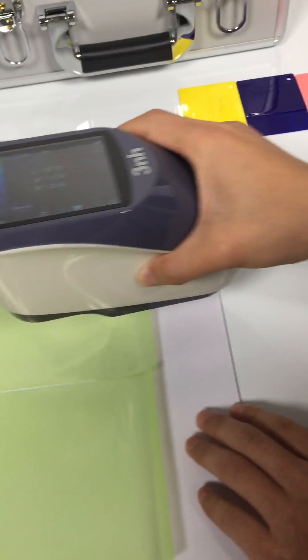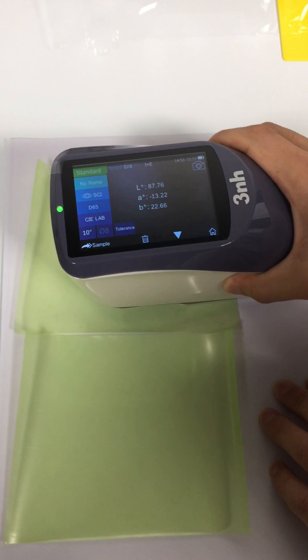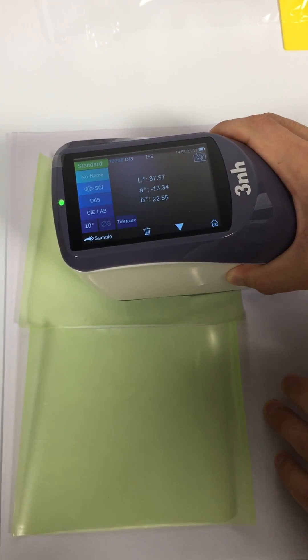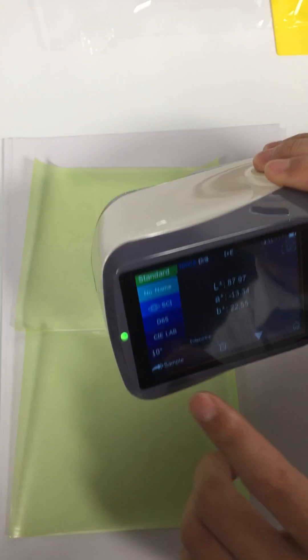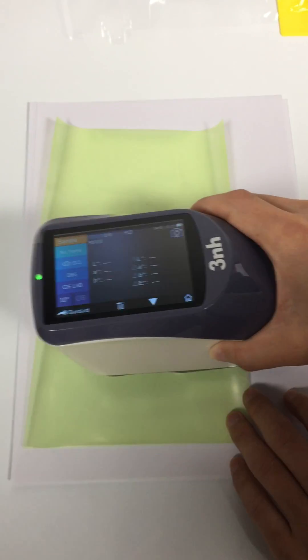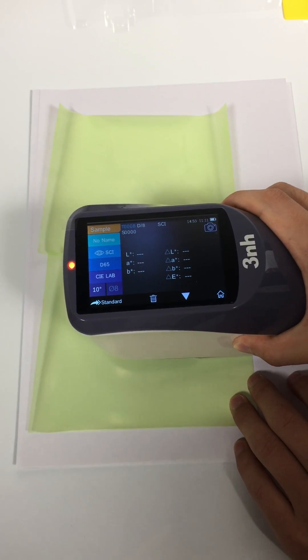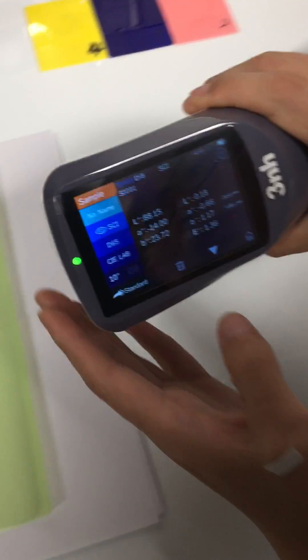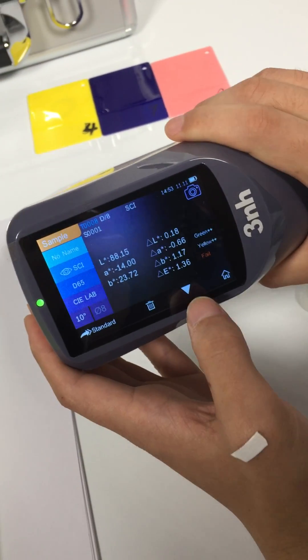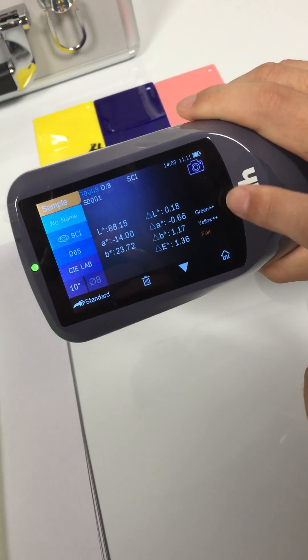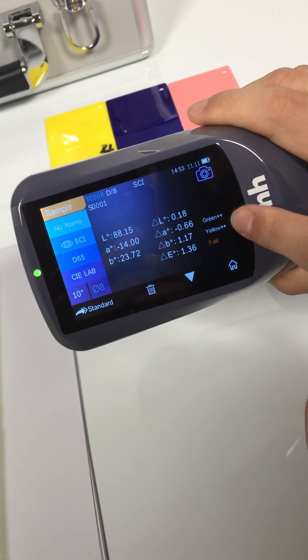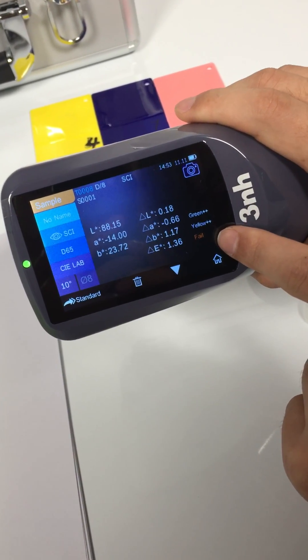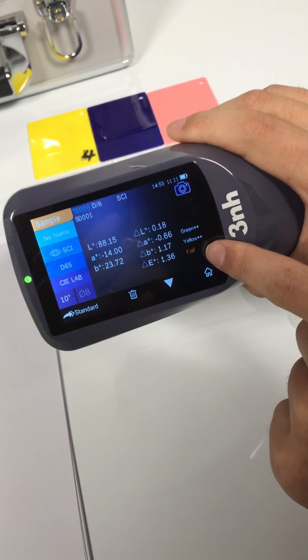First, mirror a standard. And then mirror a sample. This is the test result. Here is the color offset indication, and here is the test result judgment.